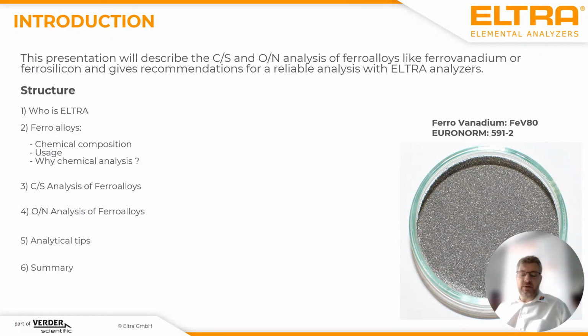This is especially interesting for people who already have an analyzer, or maybe they are getting some trouble during analysis and maybe they see some effects they don't understand. In this chapter, I will give you a short feedback about main topics, why maybe the result is different in comparison to the one you expected. And then you have a short summary.